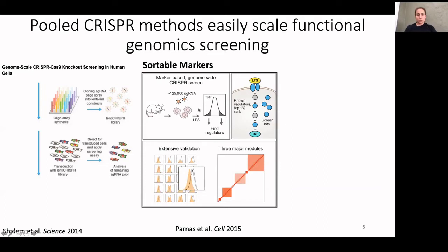However, this does require the ability to have your readout be FACS-based, where total cell fluorescence is what you're interested in. And as we all know with imaging, it's often not about total cell fluorescence, but rather more specifically where in the cell something may be localized.